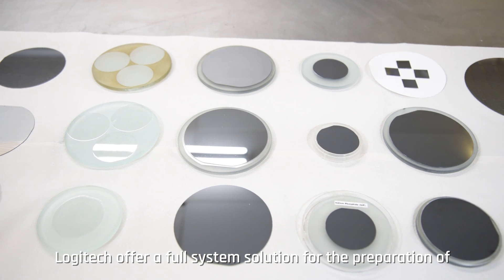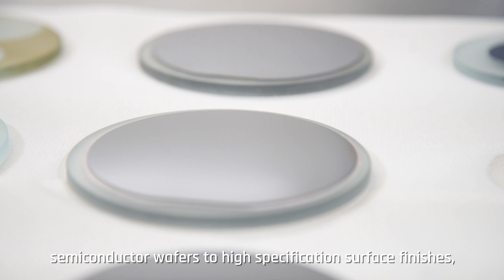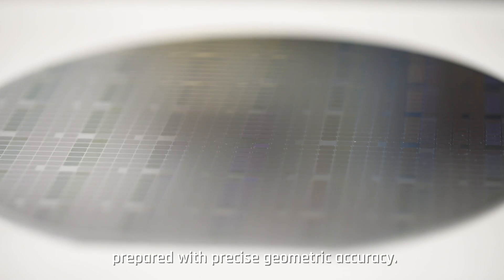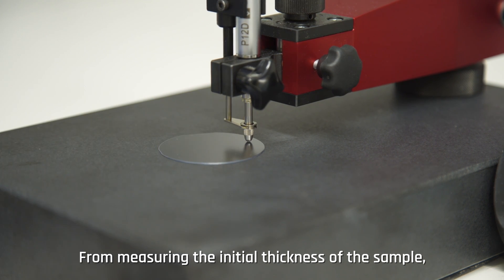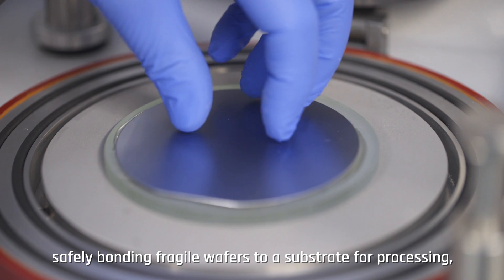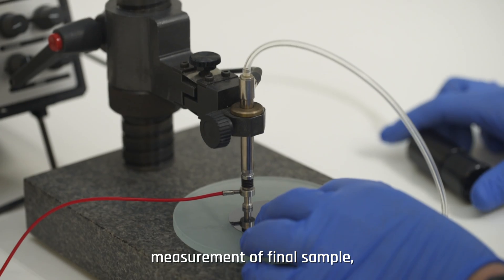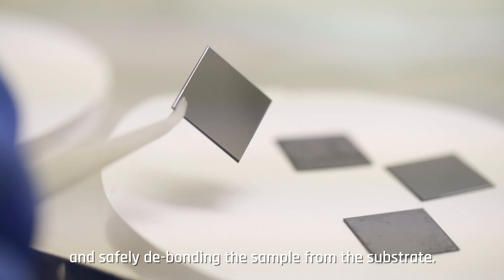Logitech offers a full system solution for the preparation of semiconductor wafers to high specification surface finishes prepared with precise geometric accuracy, from measuring the initial thickness of the sample, safely bonding fragile wafers to a substrate for processing, lapping, polishing, measurement of final sample, and safely debonding the sample from the substrate.